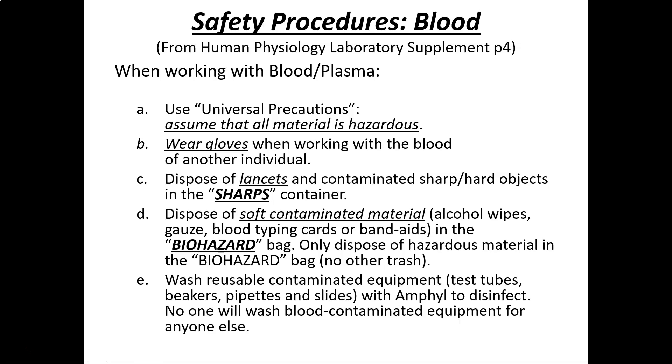One of the safety precautions when dealing with blood — especially important for those of you entering a medical or dental field — is what they call the universal precautions. Basically, universal precautions say that all material is hazardous; assume it's going to kill you and act appropriately. You certainly need to wear gloves when working with blood of another individual. If you're working with your own blood, you wouldn't need gloves, but gloves must be worn when handling a blood sample from someone else.